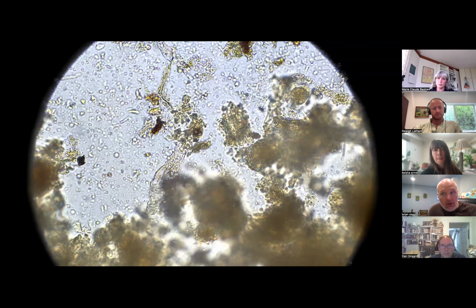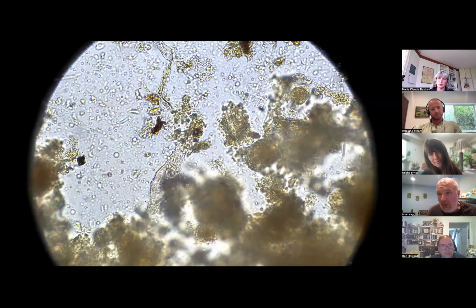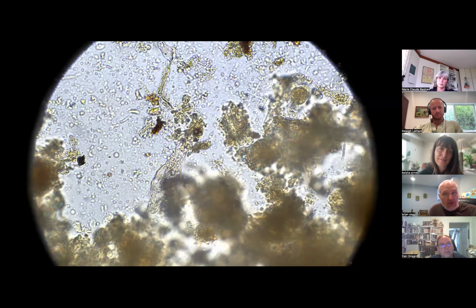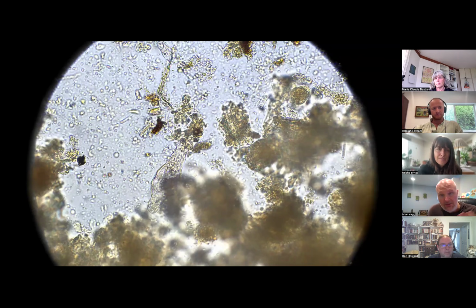So within a very small area in this particular sample, three rotifers, and I saw a lot of other rotifers before this as well. So they obviously populated well in this kind of facultative, going anaerobic, very anaerobic kind of degrees. They can exist in a lot of different soil profiles. If I see a huge amount of rotifers like here, it's probably looking like it was anaerobic at some point, or in the facultative state. But like I said, I've seen them in very healthy soils too.